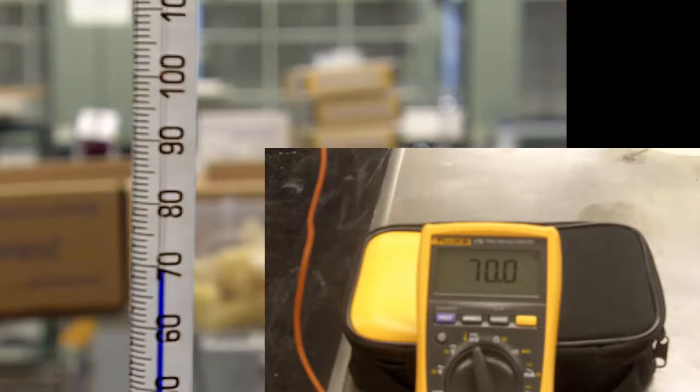Now the digital thermometer is reading 70 degrees Celsius and the traditional thermometer is reading about 69.5 degrees - within a degree at this point. We'll go ahead and let this run some more; hopefully it'll make it to 80 before we run out of film and we can see how close they are, where before we were seeing a 10 degree difference between the thermocouple digital reading and the thermometer reading.